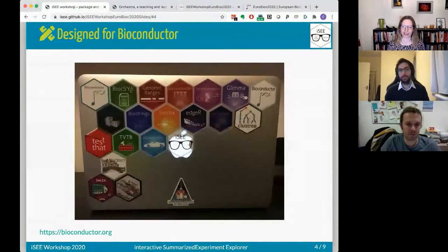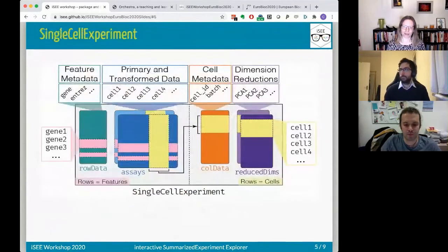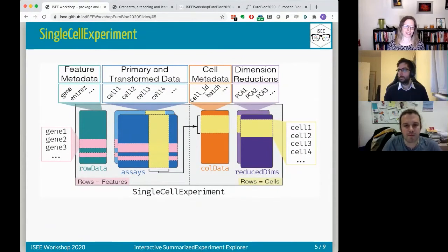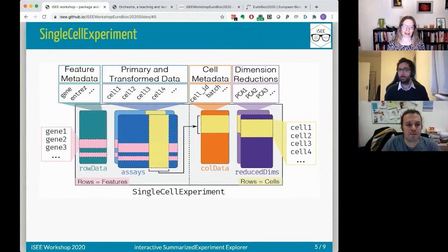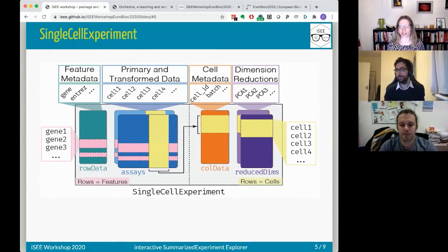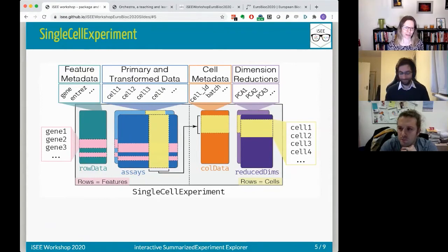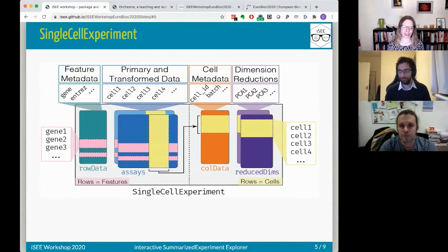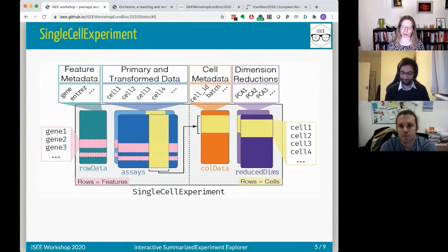iSEE is in Bioconductor and is designed really for Bioconductor. The name stands for Interactive SummarizedExperiment Explorer, which says already what it's doing — it's an interactive exploratory tool for SummarizedExperiment objects. It works on SummarizedExperiment objects but also on any objects that extend or inherit from SummarizedExperiment, like the SingleCellExperiment, DESeq2 datasets, or TreeSummarizedExperiment.